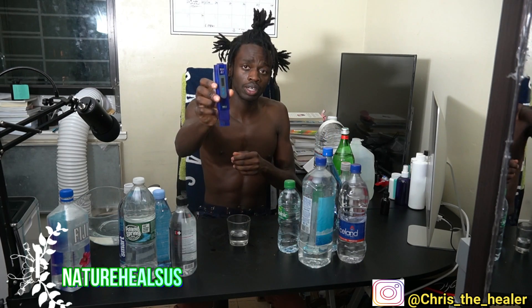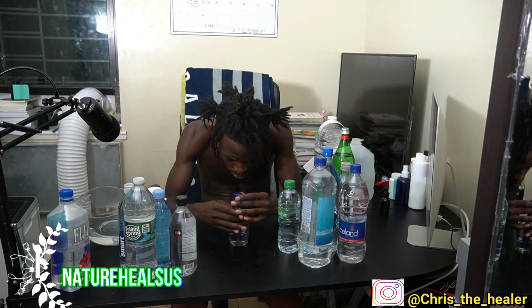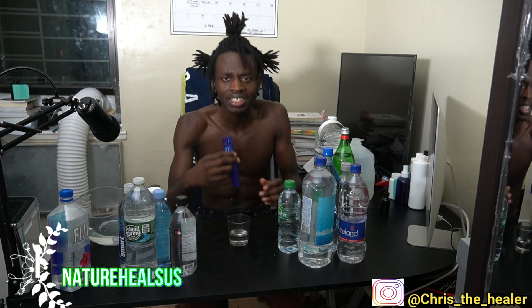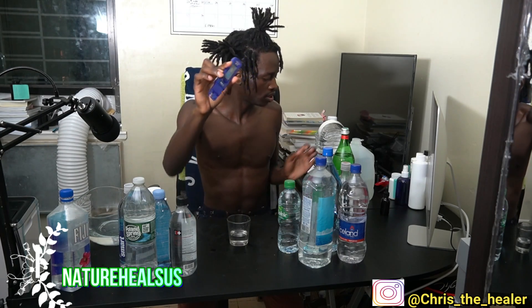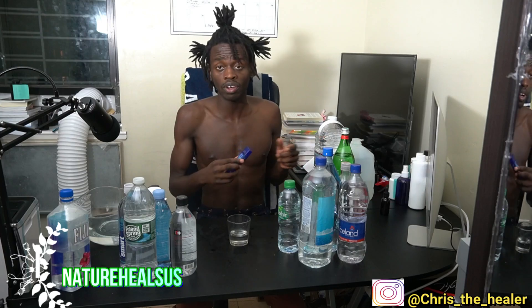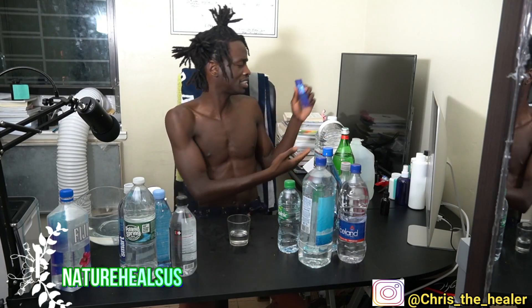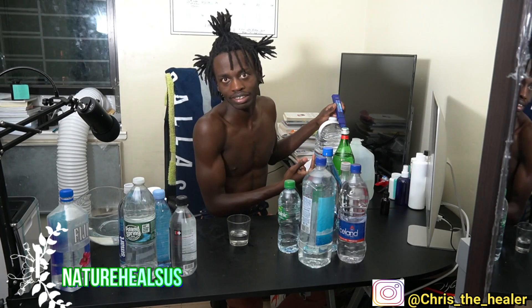The meter is at zero PPM, which is what we want, and then we put in the water. It's 176 parts per million — 176 PPM. That falls in hard water range, just like Crystal Geyser. The only difference is it's in a glass bottle.